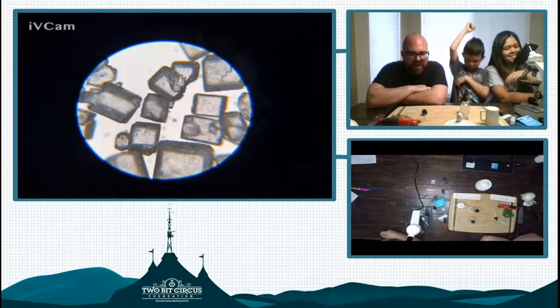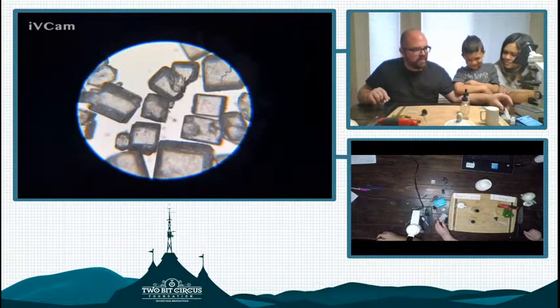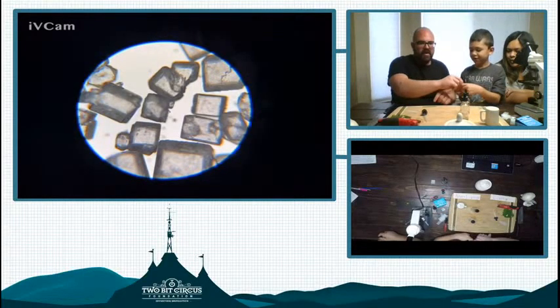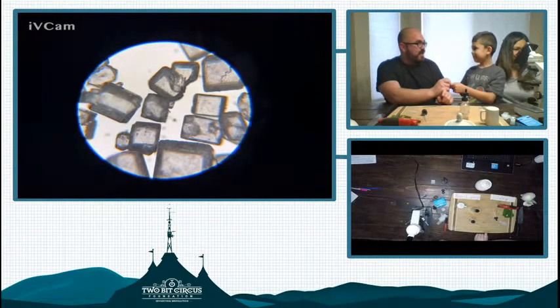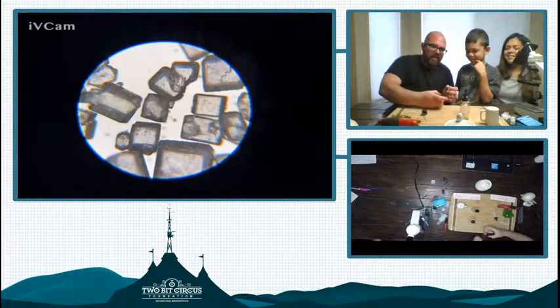Awesome. So Robert's been correct on everything so far, huh? All right, let's prep the next slide. What are we going to do next, Robert? You want to do this one next? With cork. Well, you can't mix the samples, right? Because then we won't know which is which. How about we do that first and then we put sugar on? Okay. After we look at it, we can.